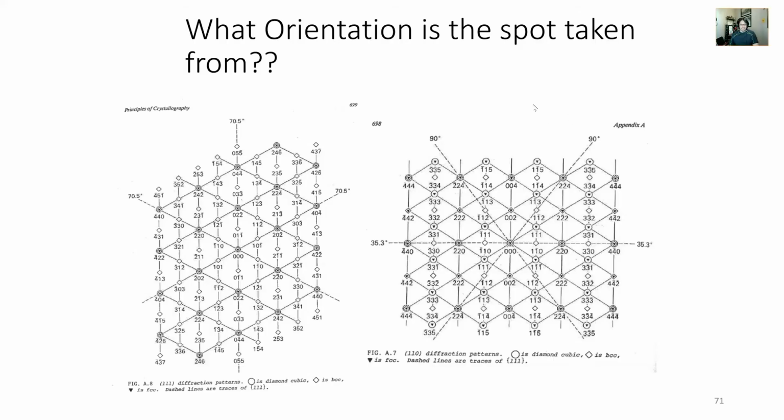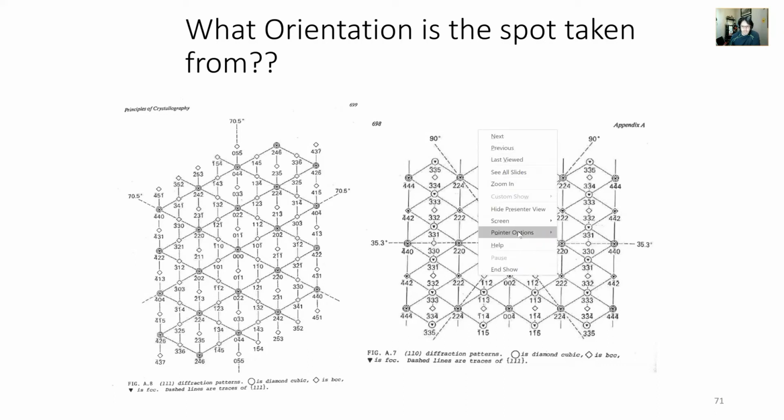I've taken a little pause here because I noticed that this is incorrect. The zone axis is a direction, and they're using parentheses in this book, and I won't say where I got this one from because this person swore to me they never made a mistake. But let me just use my laser pointer. So this should actually be direction notation, and it's clearly plane notation. And I was so taken aback, I went and looked up Miller indices again, just to make sure I wasn't lying.